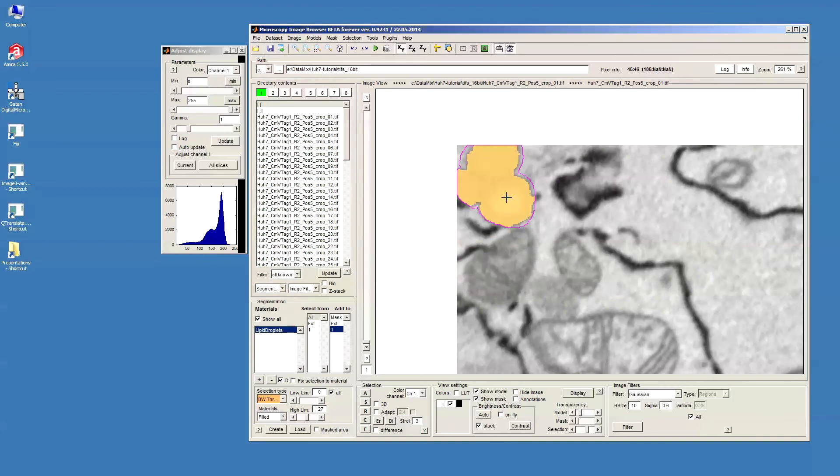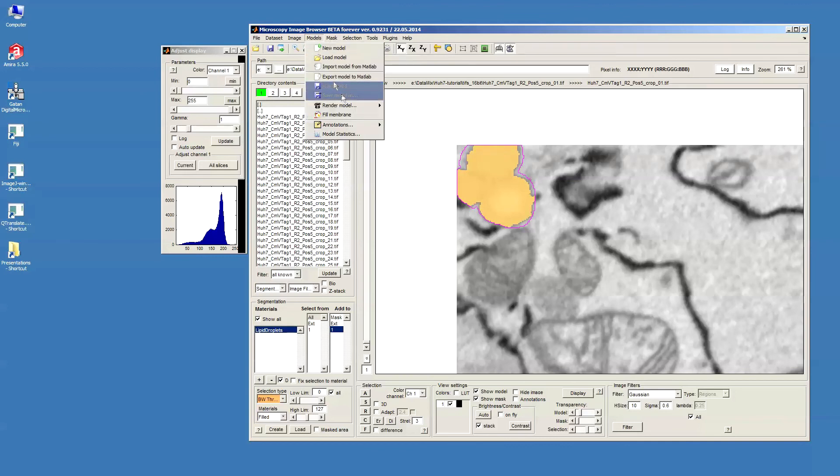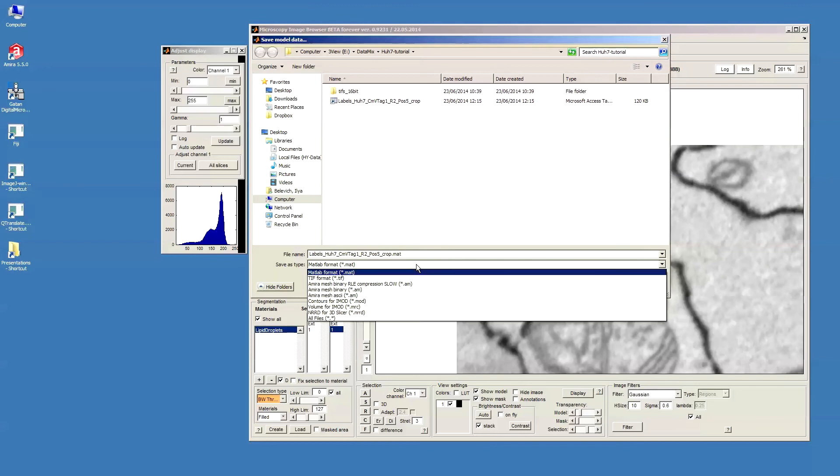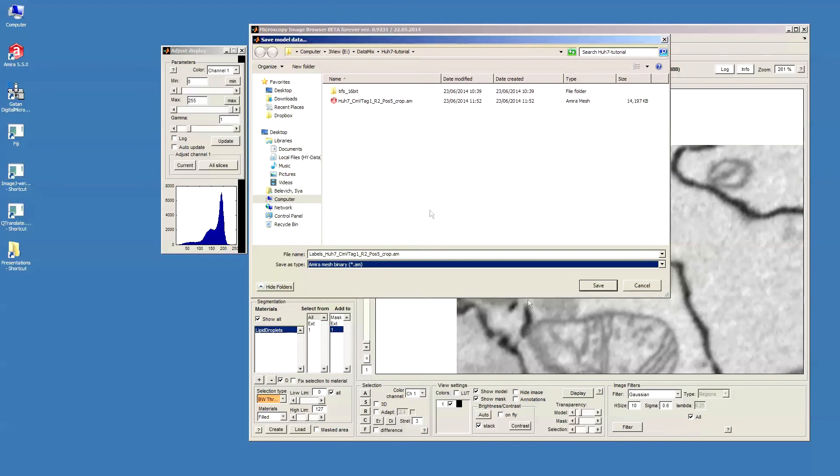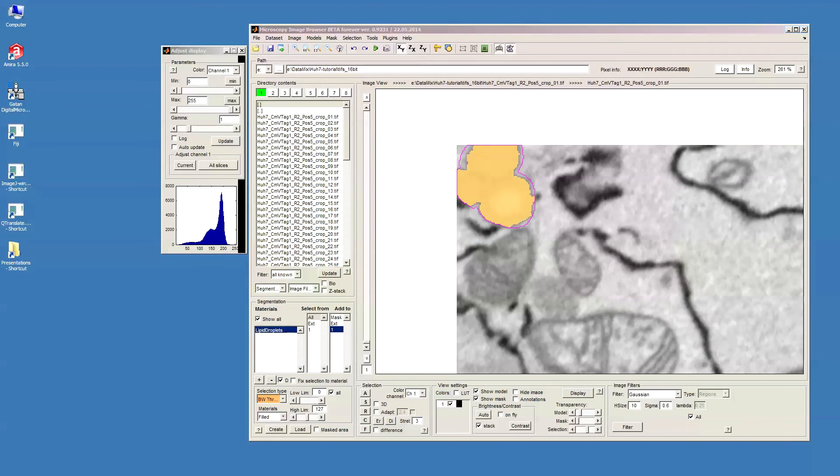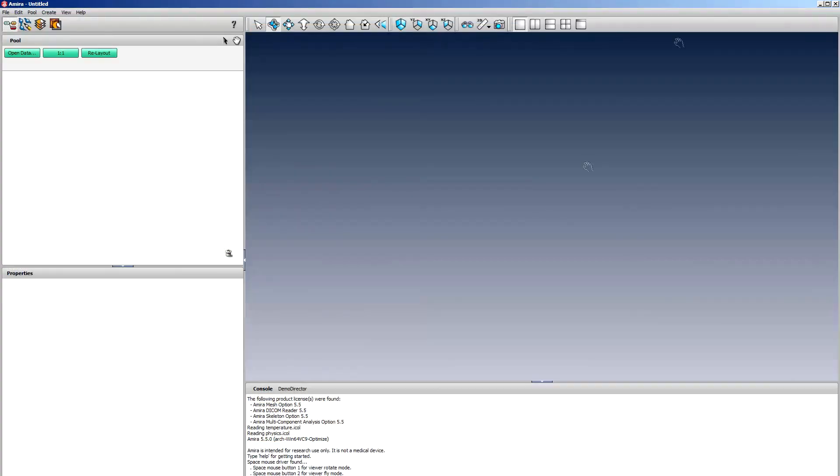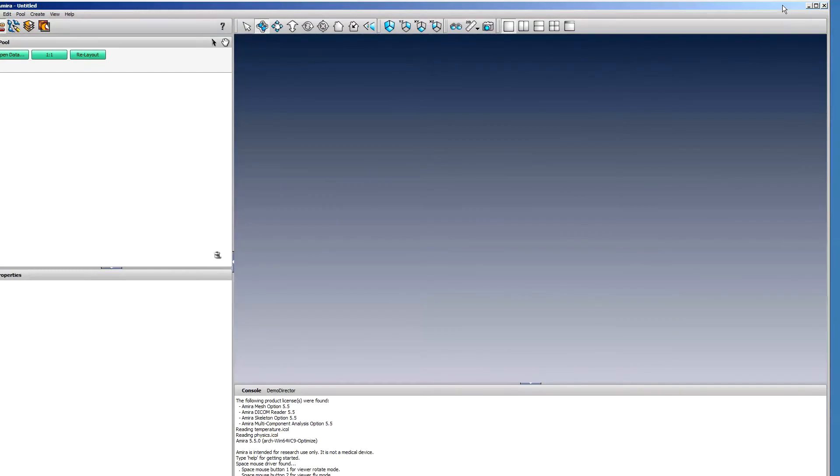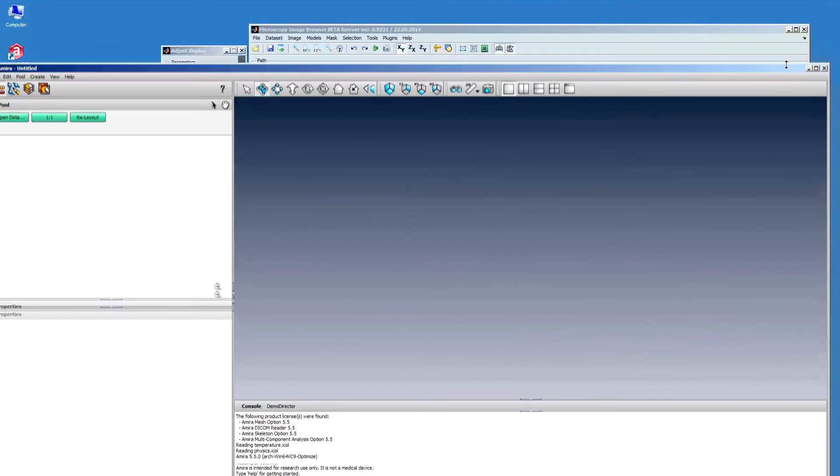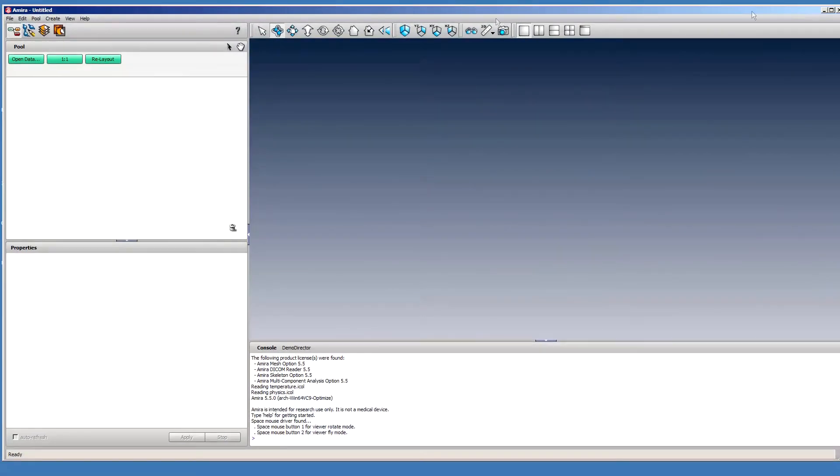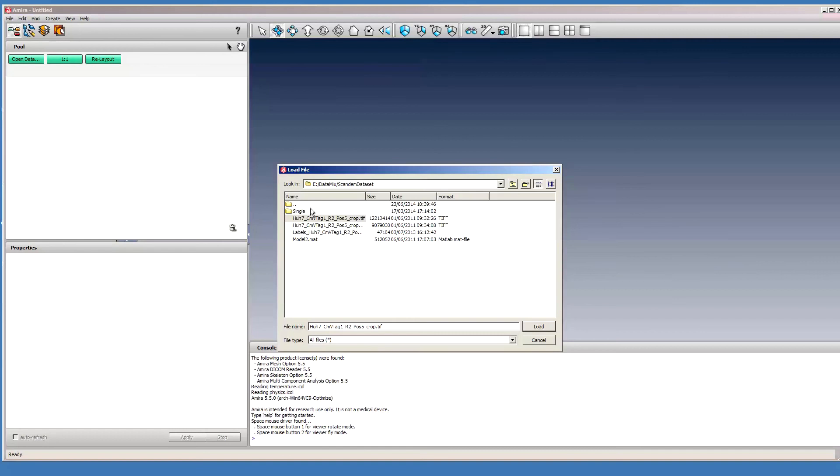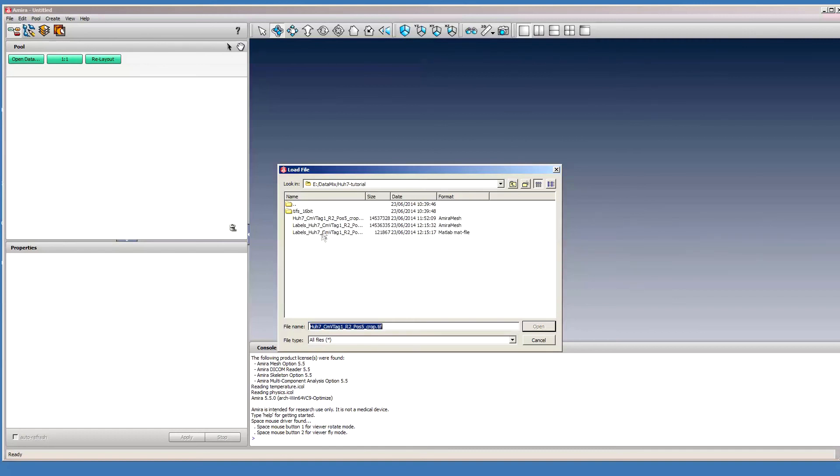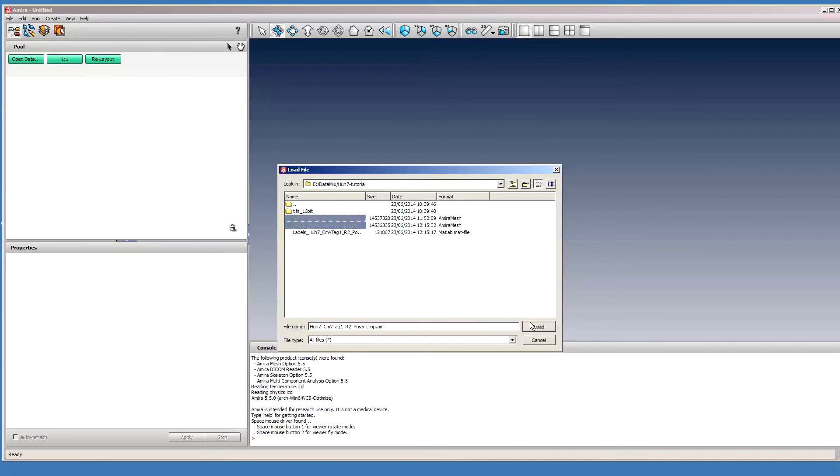For the visualization purposes I can use for example AMIRA. And what I can do is I can again go to this model, save model S, but this time I save the model as the AMIRA mesh binary. Then I can open AMIRA. Let's make it a little bit smaller. I can go open the data that was here. I will open my original data and the labels to that.